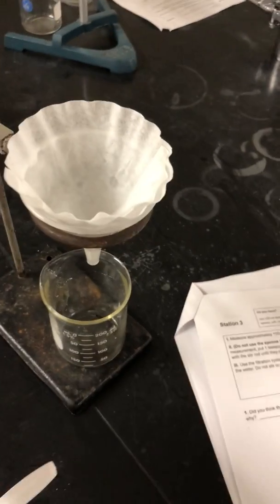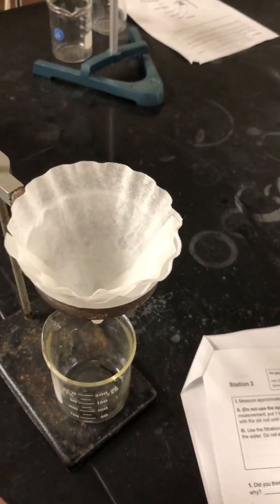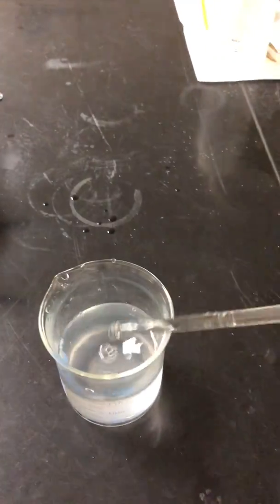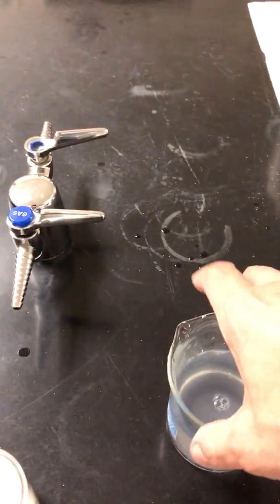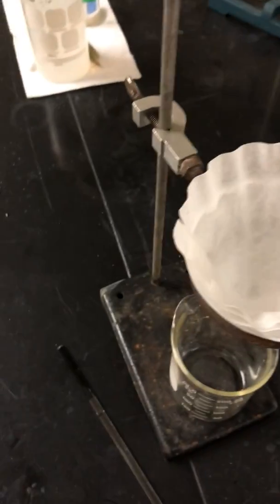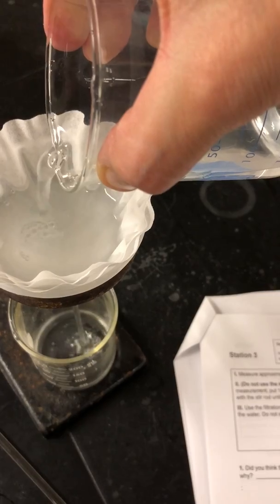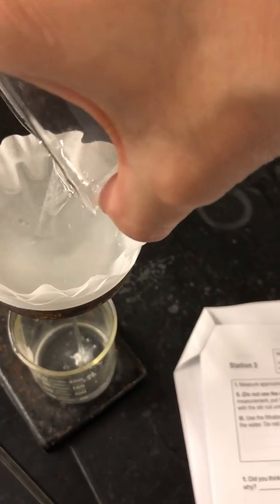Beautiful. Okay, and then it tells us to use the filtration system to see if I can separate the salt and sugar from this mixture. Okay, I'm already thinking about that. You be thinking about that. Do you think this is gonna work? Pour it in. And you are going to wait.